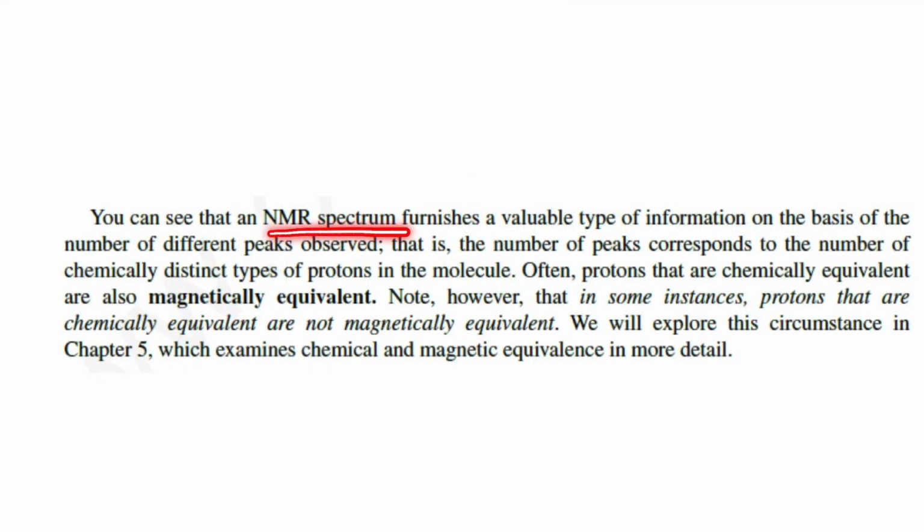So hence we see that the NMR spectrum furnishes very valuable information on the basis of the different peaks observed, and these different peaks correspond to the number of chemically distinct or non-equivalent protons in a molecule.